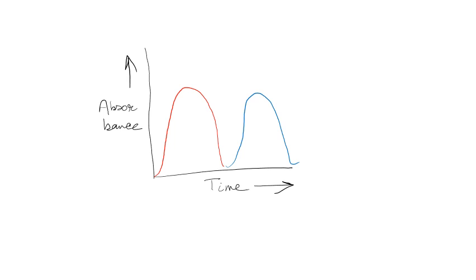It's a very bad picture, but you can understand the basis. The red curve is due to the larger molecule, and the small molecule gives the blue absorbance curve. The blue curve is shown at more time, and the red curve is shown at lesser time.